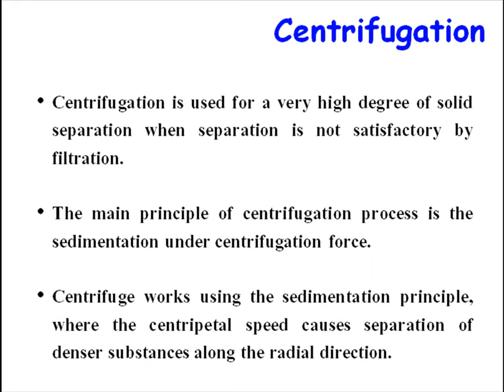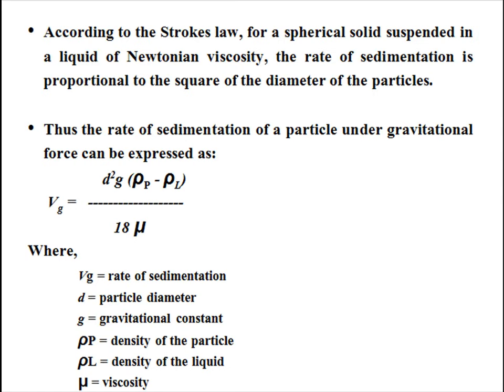Next most important method is centrifugation. This is used for a very high degree of solid separation when separation is not satisfactory by filtration. The main principle of the centrifugation process is sedimentation under centrifugal force. A centrifuge works using the sedimentation principle, where the centripetal force causes separation of denser substances along the radial direction. According to Stokes' law, for a spherical solid suspended in a liquid of Newtonian viscosity, the rate of sedimentation is proportional to the square of the diameter of the particles.